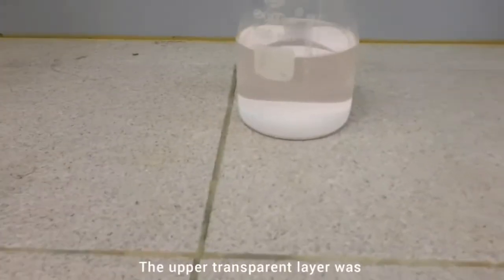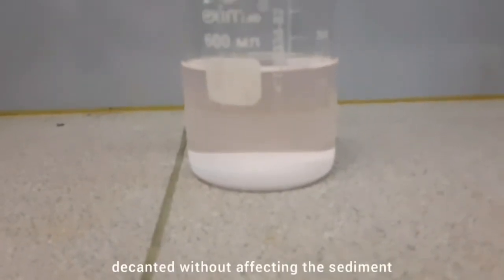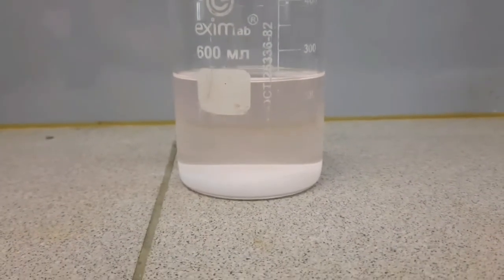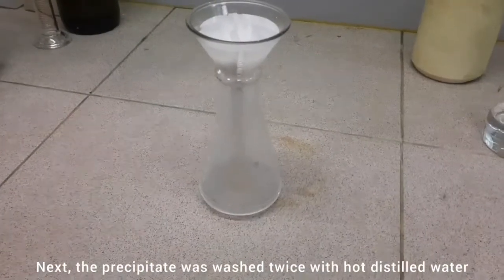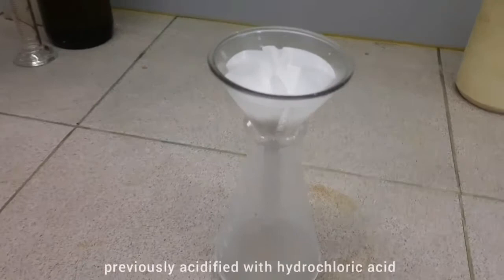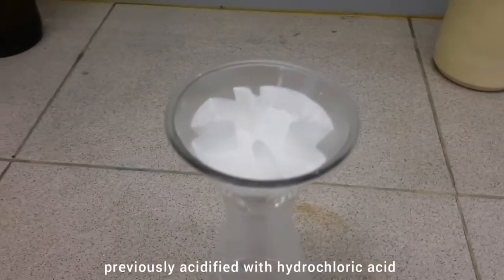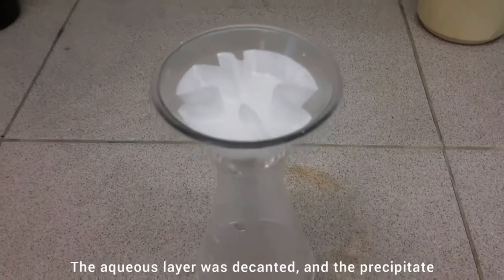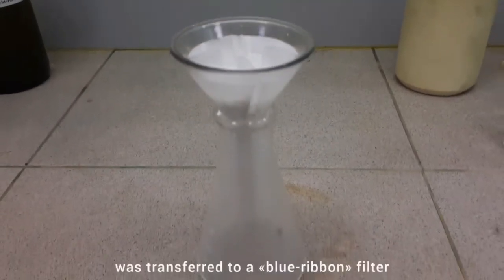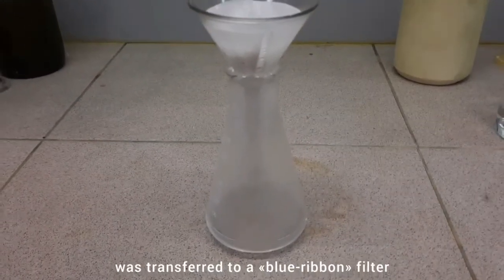The upper transparent layer was decanted without affecting the sediment. Next, the precipitate was washed twice with hot distilled water previously acidified with hydrochloric acid. First, the aqueous layer was decanted and the precipitate was transferred to a blue ribbon filter.